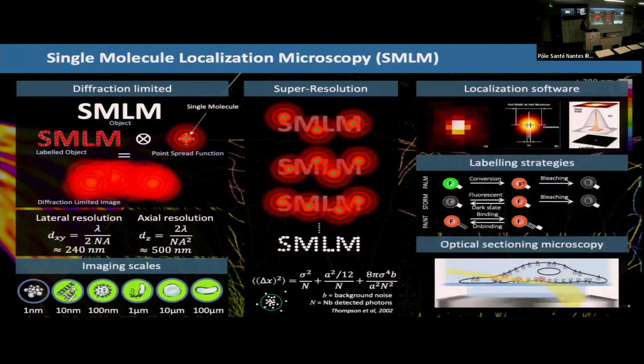What you need to have this technique really functional and achieve, let's say, at least sub 50 nanometer resolution, beside the localization and having a good labeling strategy, is optical sectioning. This is mandatory if you want to get single molecule photons above the background. This is why this technique has really been used to image structures in very close proximity to the coverslip, and it's very limited as soon as you want to go deeper into the sample.